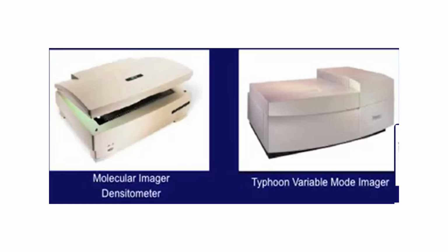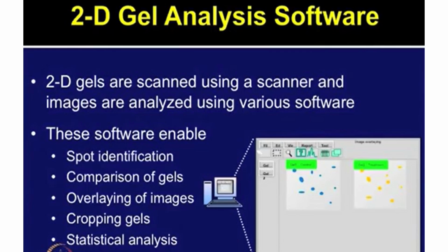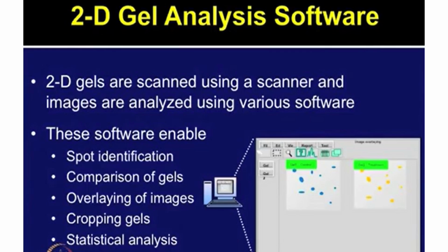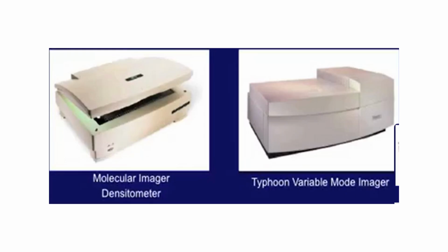If you don't want to go till mass spec, though mass spec is much more accurate, you can still do a good amount of analysis using these kinds of instruments. So, densitometry: this specific instrument will help you find which specific protein is upregulated or overly expressed, because it basically determines the density. If you have seen any gel image, for each specific spot or band, it will try and determine how much protein is there. So it will give relative readings, basically.